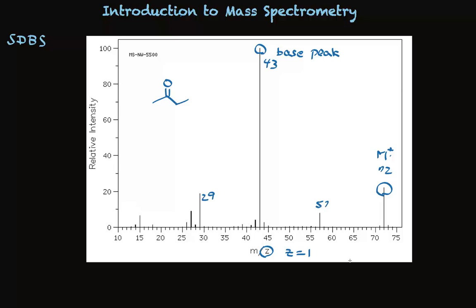And there is some rationality to how this actually happens. For example, to form the molecular ion, where do you think that electron is going to come from? Well, it's going to come from where there's the greatest abundance of electrons available for loss, and look at that.